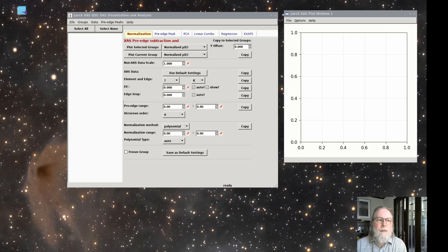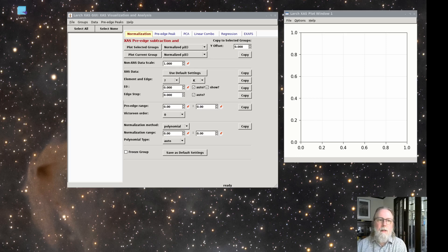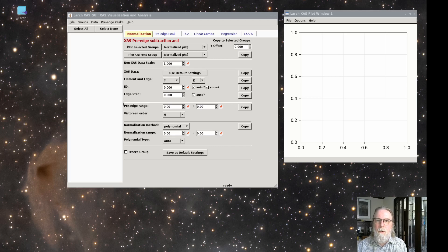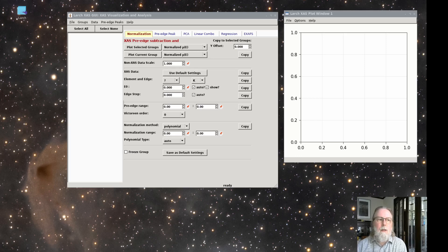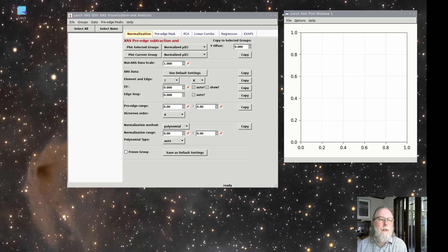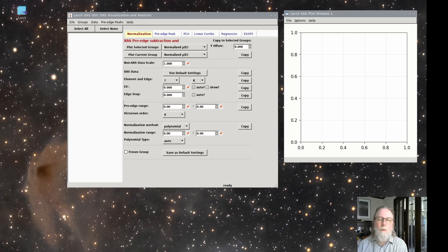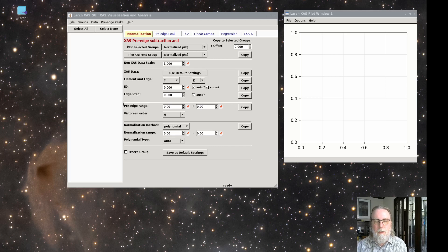The goal of the normalization process is to get XFS data, mu of E, that goes from a value of about zero below the edge to a value of around one well above the edge. The normalization will remove most of the differences in how we measure the data, whether in transmission mode or fluorescence mode.